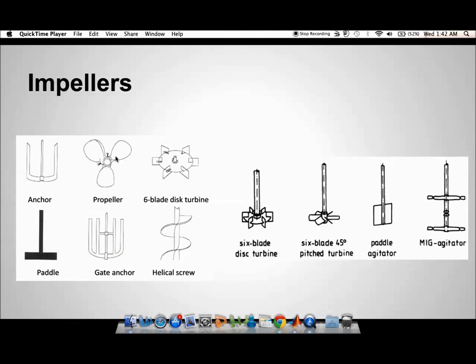My part of this project was incorporating the fluid mechanics of the bioreactor and how that ultimately affected the power to run the bioreactor and the cost of it.